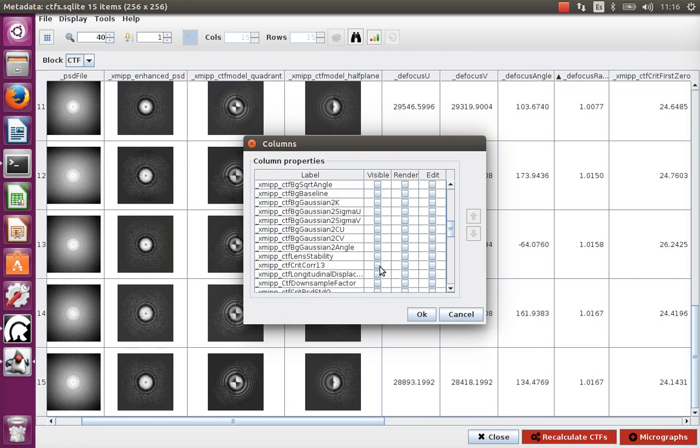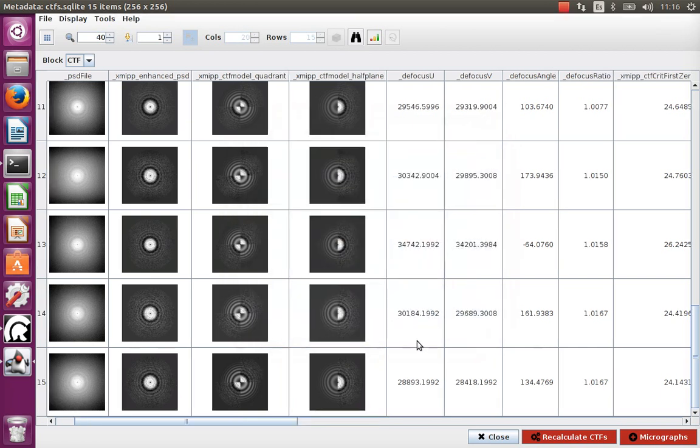So we can verify this one, this one, this one, and we will check all those to see what they mean.